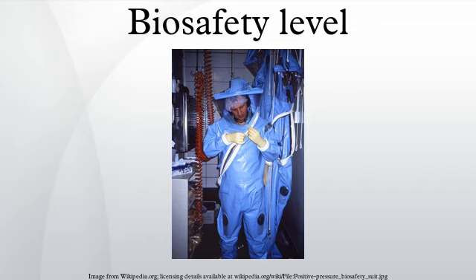In this circumstance, an acceptable level of safety for the conduct of routine procedures may be achieved in a Biosafety Level 2 facility, providing the filtered exhaust air from the laboratory room is discharged to the outdoors, the ventilation to the laboratory is balanced to provide directional airflow into the room, access to the laboratory is restricted when work is in progress, and the recommended standard microbiological practices, special practices, and safety equipment for Biosafety Level 3 are rigorously followed. The decision to implement this modification of Biosafety Level 3 recommendations is made only by the laboratory director.